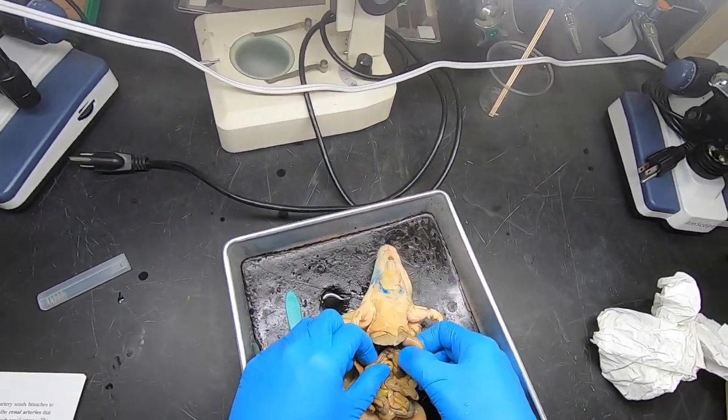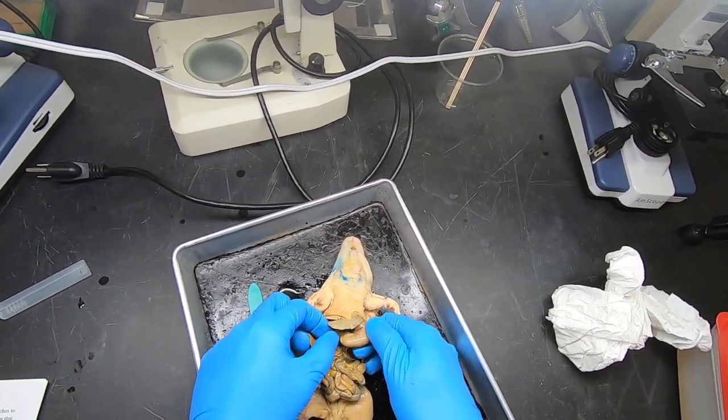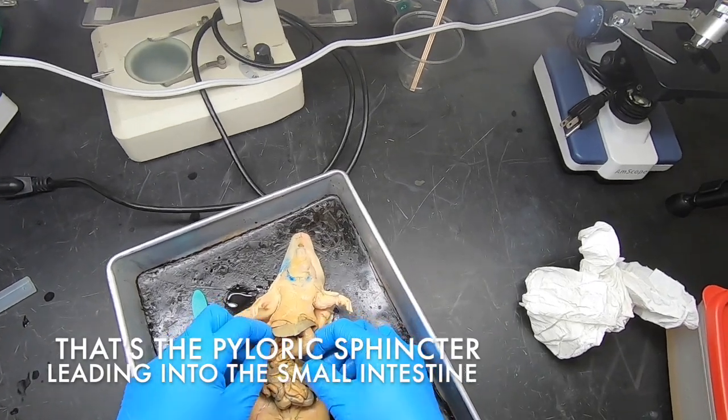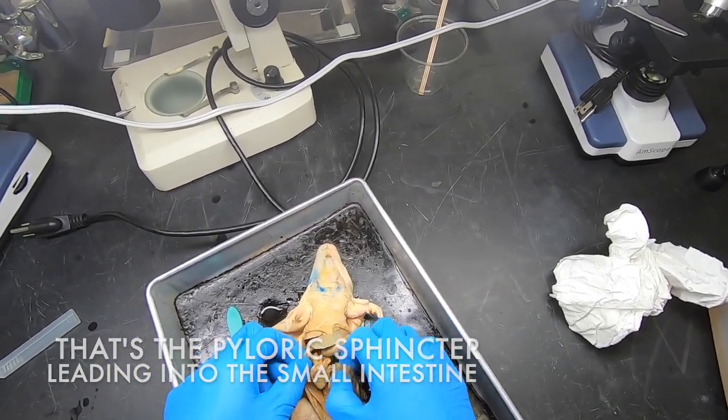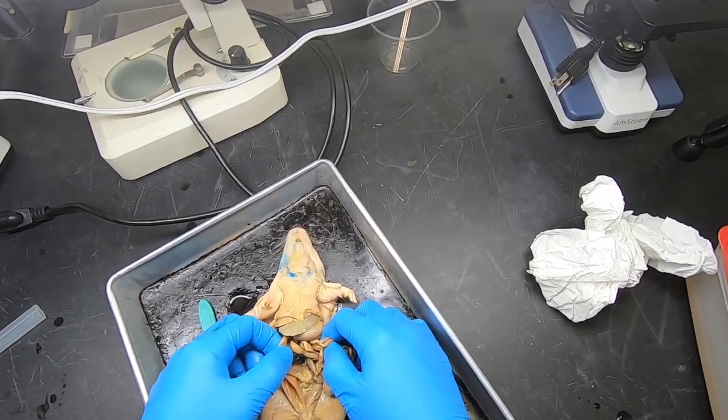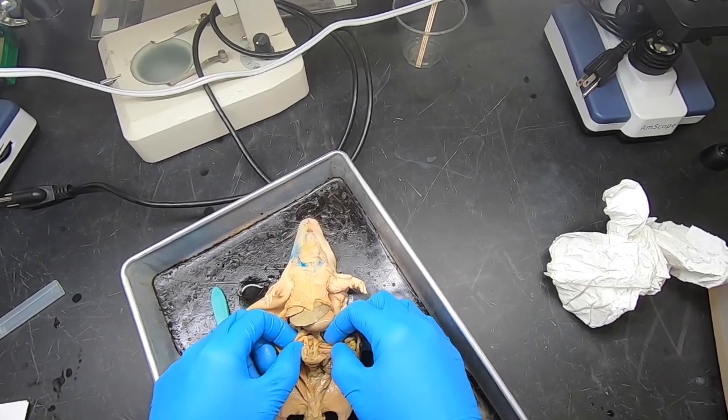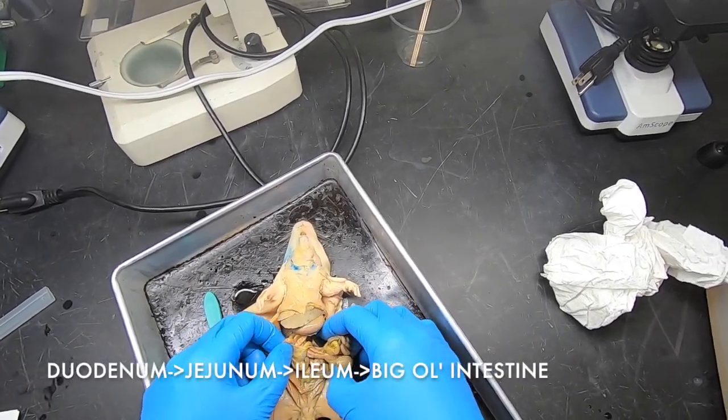And here we have another sphincter which feeds into the small intestine. The small intestine feeds down, goes all around and around. We've got the duodenum, then the jejunum.